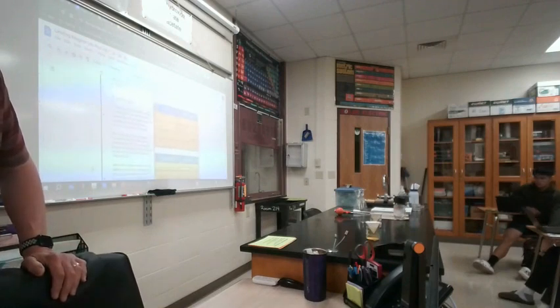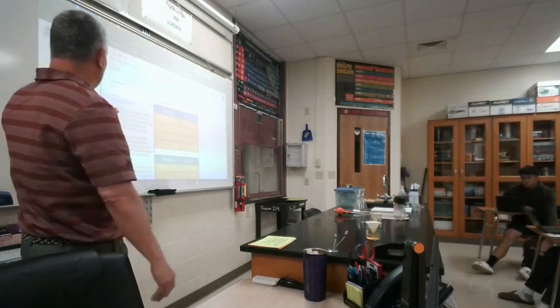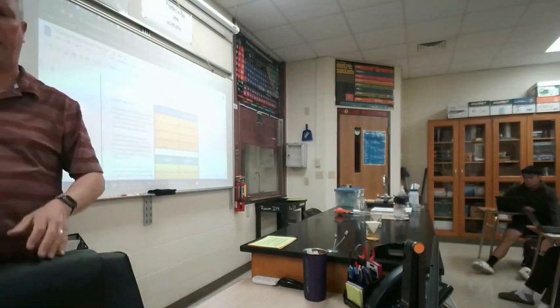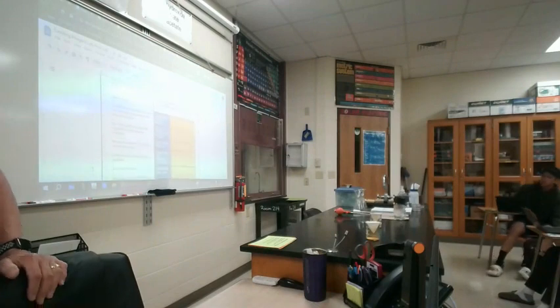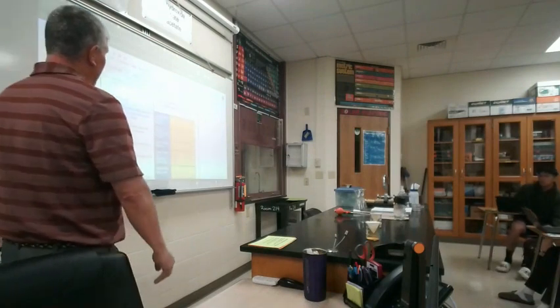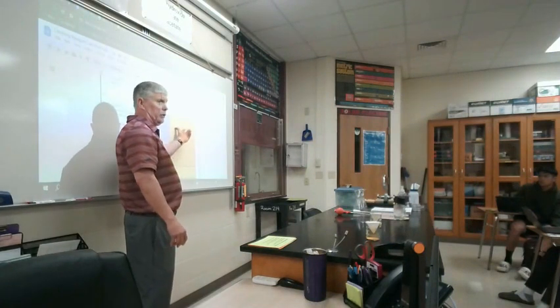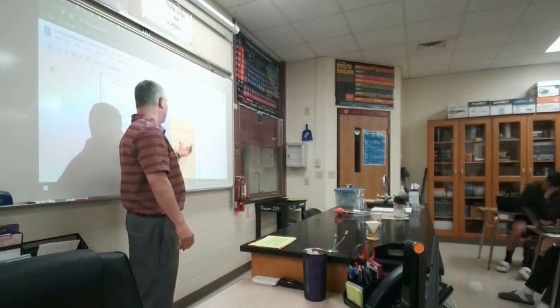You also, ladies and gentlemen, after you find the mass of the beaker, you are going to find the mass of a piece of filter paper. Those will go down in this table here, ladies and gentlemen, under quantitative data. By the way, every one of these needs a unit included with them. There are no units listed on this table. So you are going to include the unit.